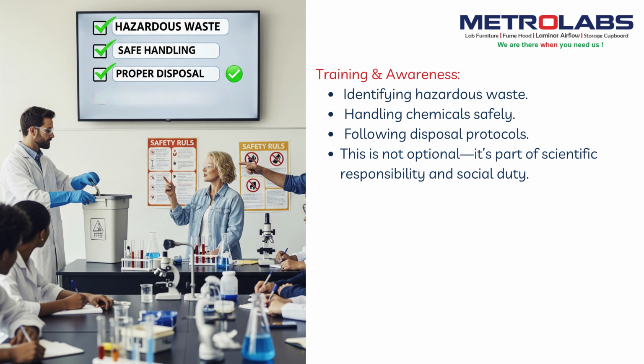Every lab assistant, science teacher, and student must be trained on identifying hazardous waste, handling chemicals safely, and following disposal protocols. This is not optional. It's part of scientific responsibility and social duty.